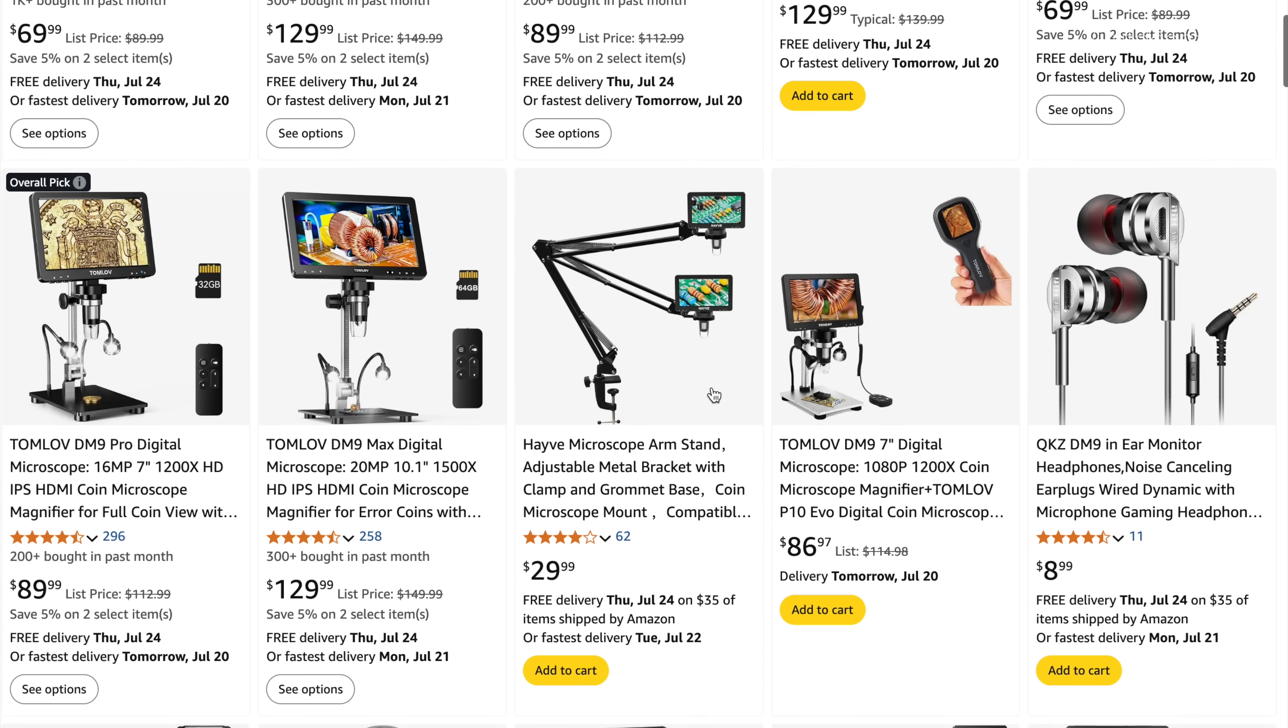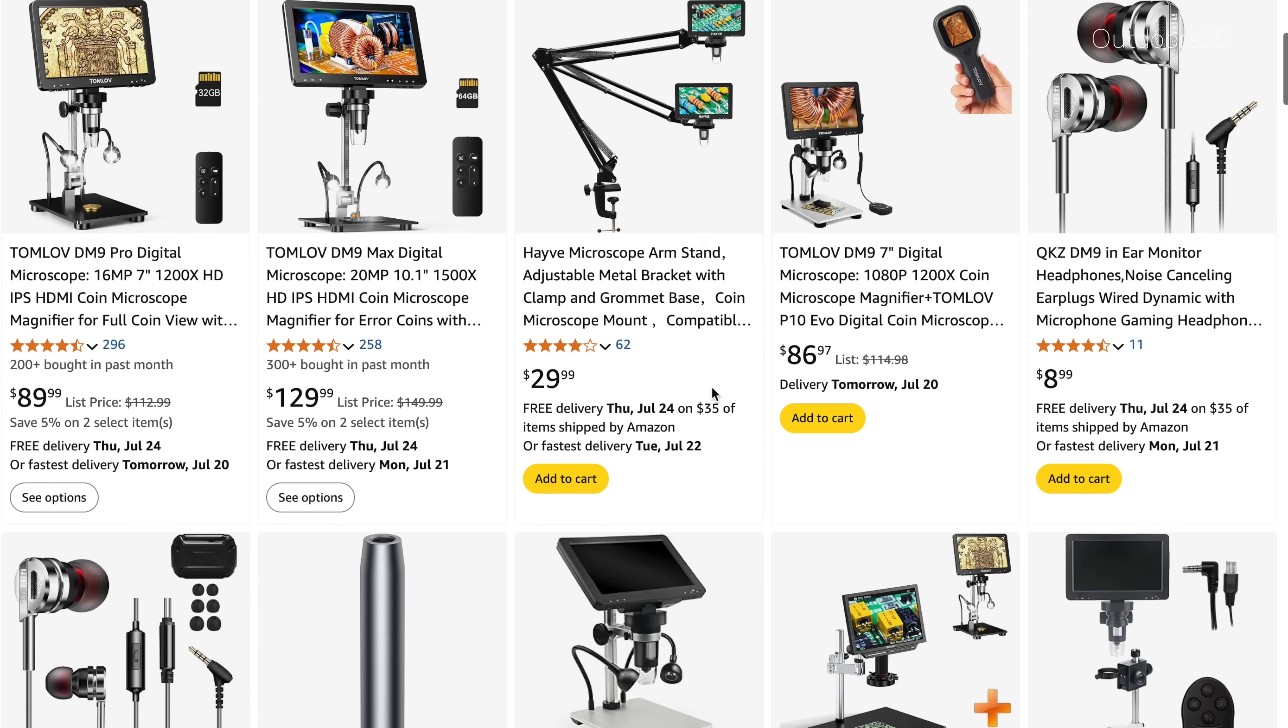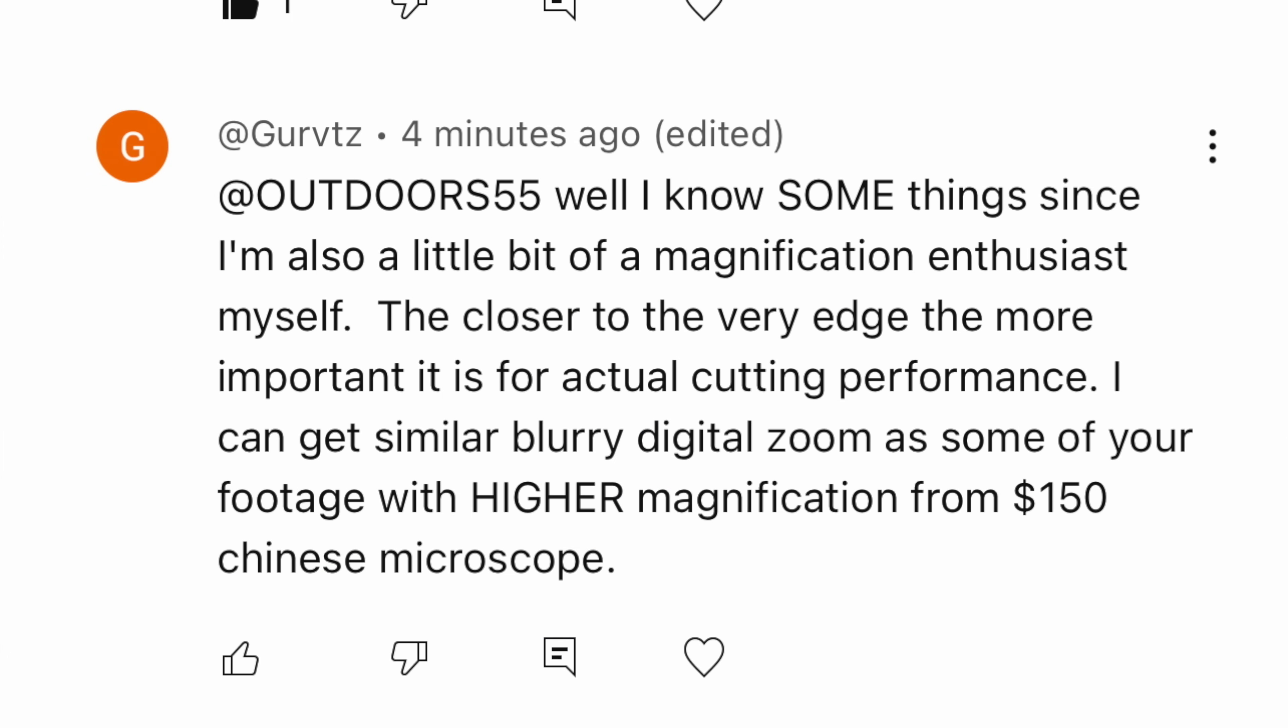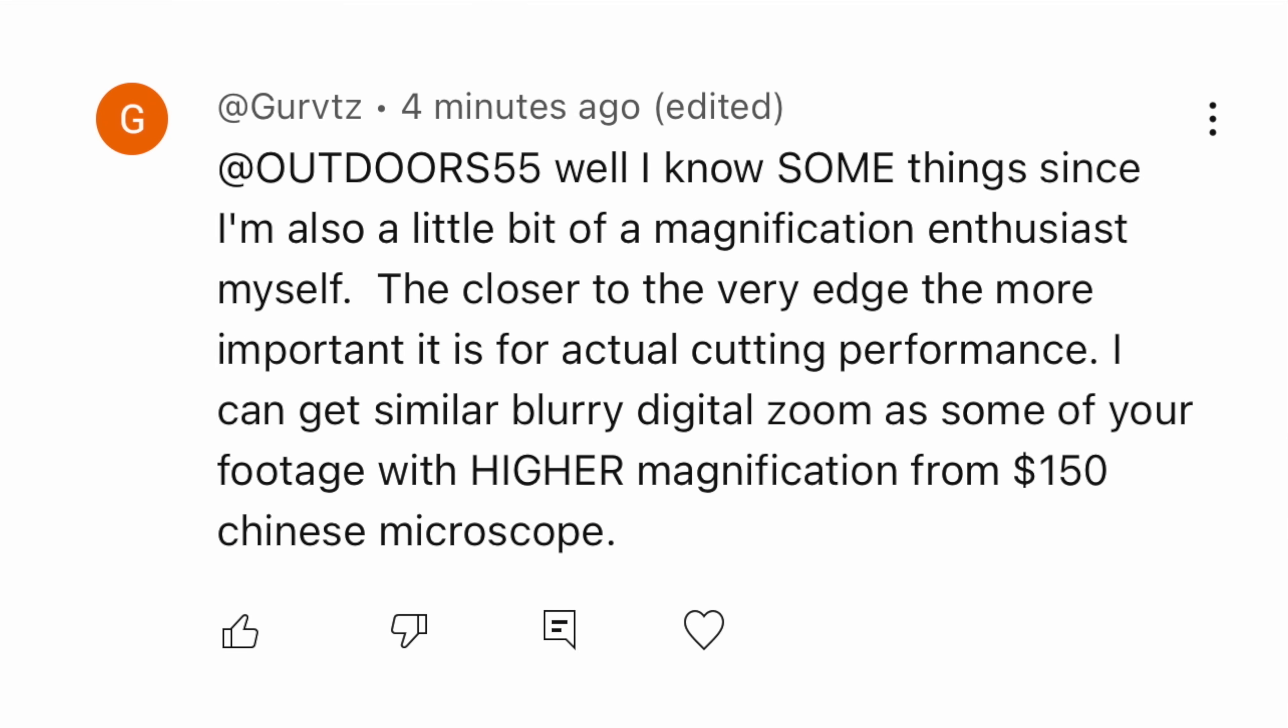A lot of people wanted to know if these cheap microscopes on Amazon are any good for looking at knife edges or other stuff up close. I've even had some trolls telling me they can get better images than what I'm showing in my videos by simply using a $150 Amazon digital microscope.